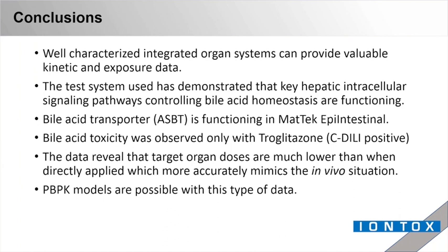And so these data reveal that target organ doses are much lower than when directly applied, which more accurately mimics in vivo situations. And as I said, PBPK models are possible with this type of data.